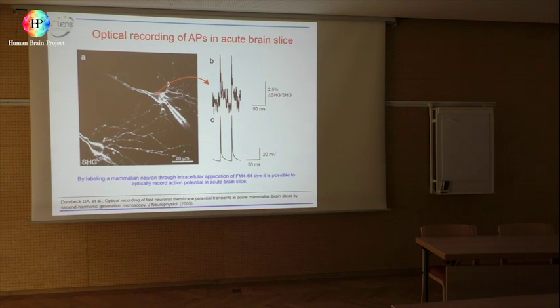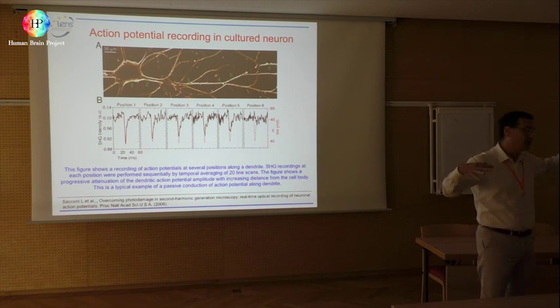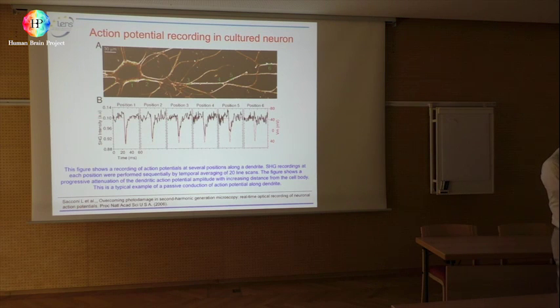Excuse me? Please. But do you visualize the neuron? Yeah, I visualize the neuron, and you see here that I visualize only the membrane and not the cytoplasm. So that's a real image you get with this? Yes, that's a second harmonic generation imaging signal. And for example, if you wanted to stain this neuron? Yes, this neuron is stained. Exactly, very good question. The neuron can be stained with bulk loading, or in this case, the pipette is doing a hole. So the pipette is used both for electrical detection and to insert the chromophores inside the neuron. Exactly.